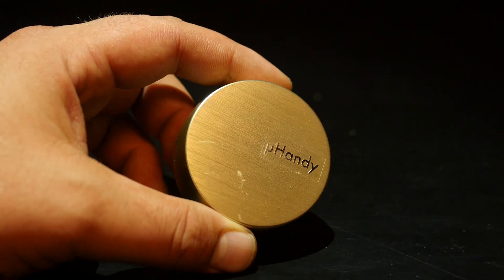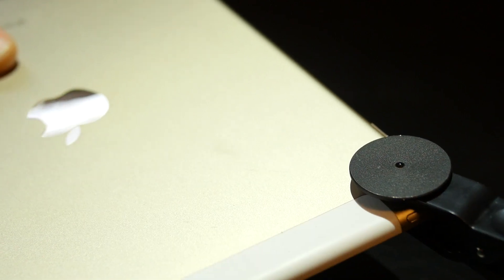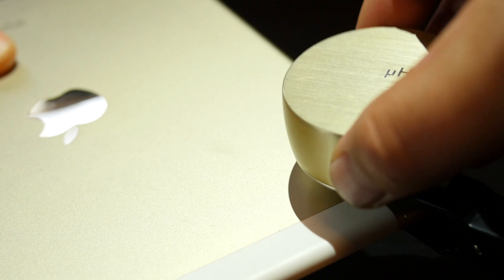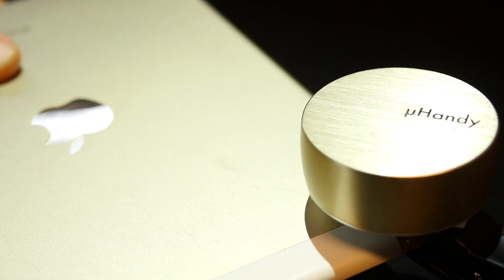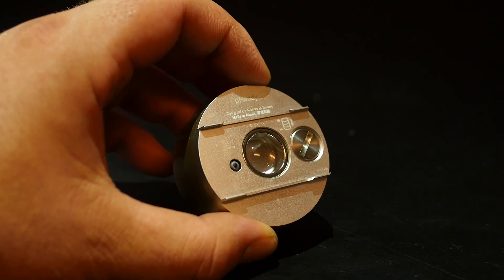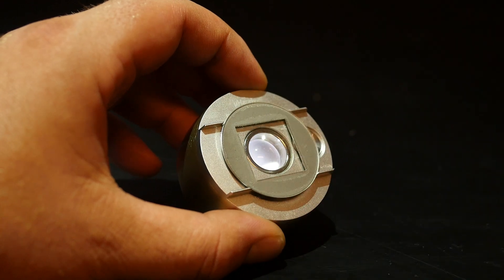This is the JRE Show and today I got something really cool I want to show you. It's called the U-Handy Microscope. This works with your smartphone — I use it with the iPhone and the iPad. It turns the camera you already have, with the addition of this piece right here, into a microscope, so you can see really, really tiny things.